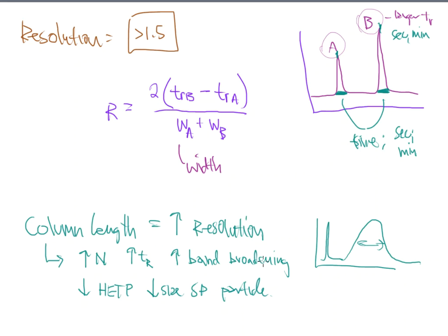And sometimes those problems, like they're listed here, are going to be big, major ones. It will make your peaks really, really fat, and you don't want that to happen. So you've got to be creative, and you've got to kind of fix that scenario if it does happen to you eventually.